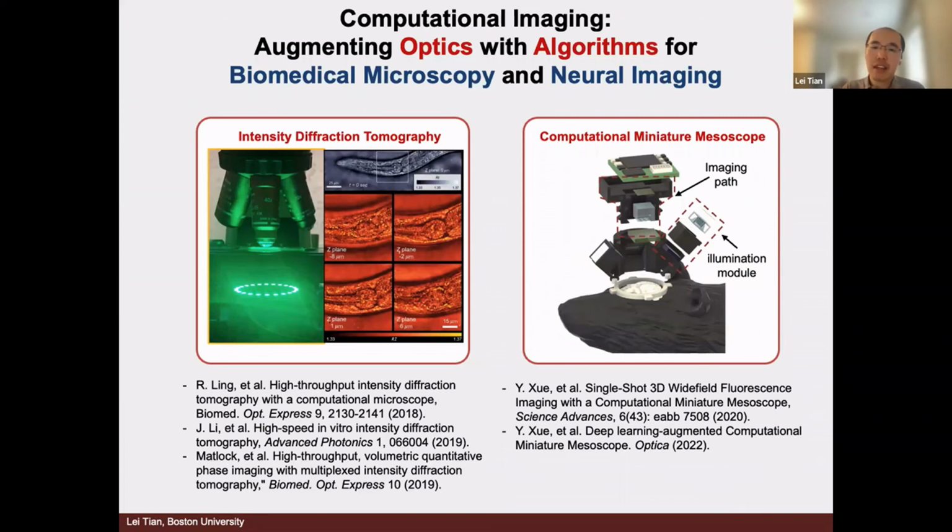The challenge right now is more on the engineering side because we're using LEDs. We have a collimator, but the spatial coherence is not great. So all of this means that if you just directly put some patterns in front of the LEDs, when the pattern reaches the working distance we're working with for this particular design, everything blurs out.